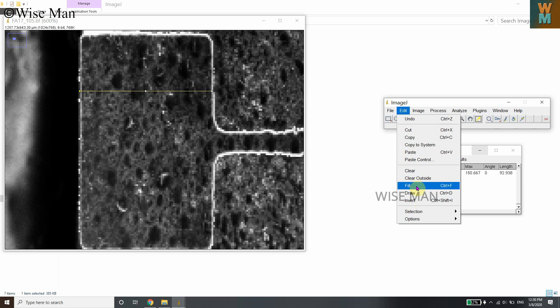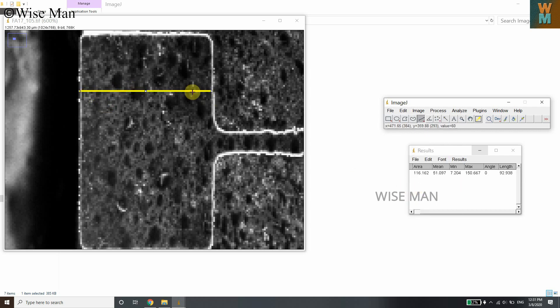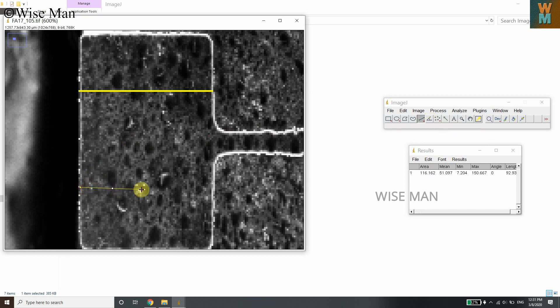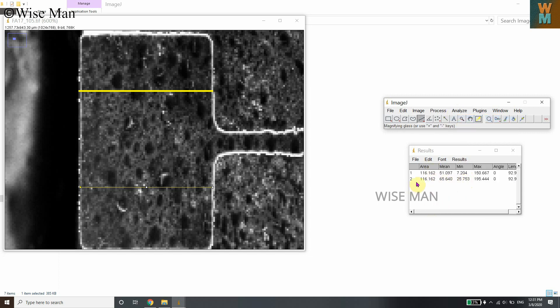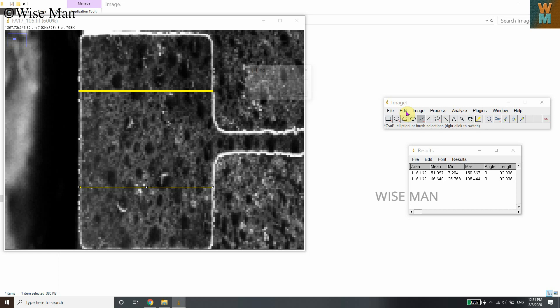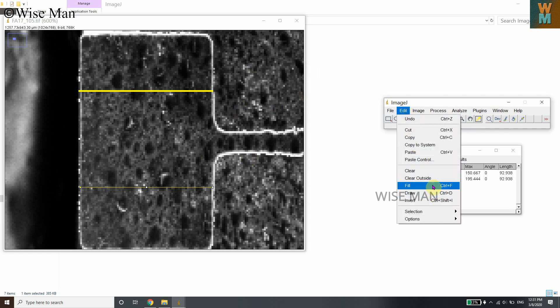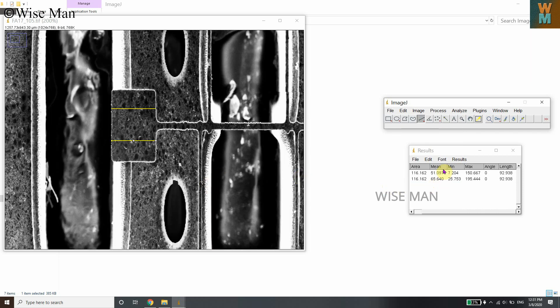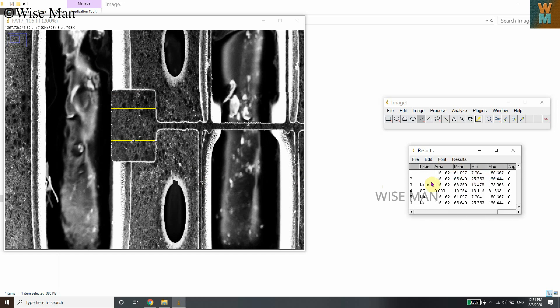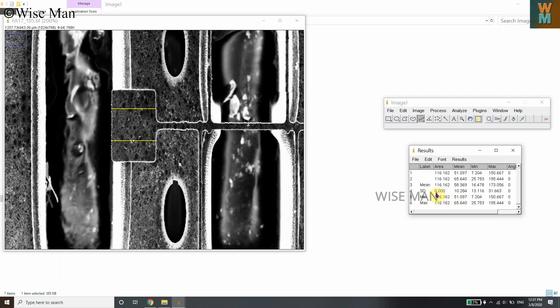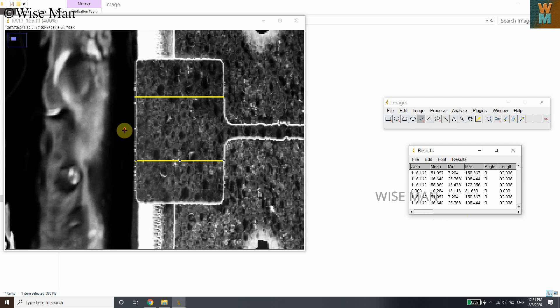After measuring, press Ctrl+F (Edit > Fill) to fill and mark the line on the image so it stays visible. You can measure a second line the same way — hold Shift, draw the line, go to Analyze > Measure, and it will again show 92.938 micrometers, then fill with Ctrl+F. In the Results window, go to Summarize to find the mean, minimum, maximum, and standard deviation for all measured lines.